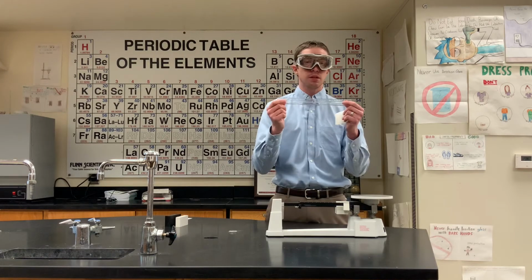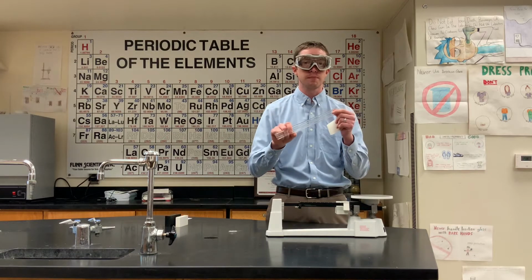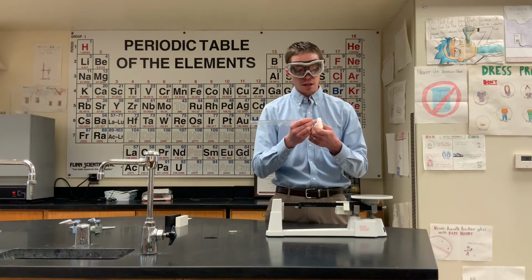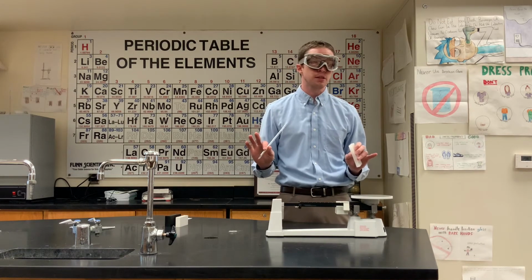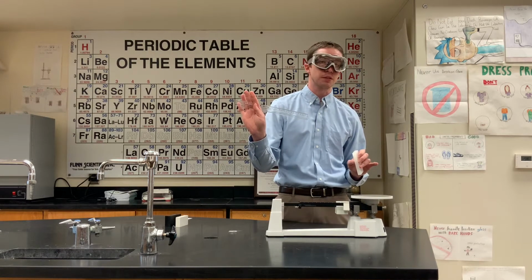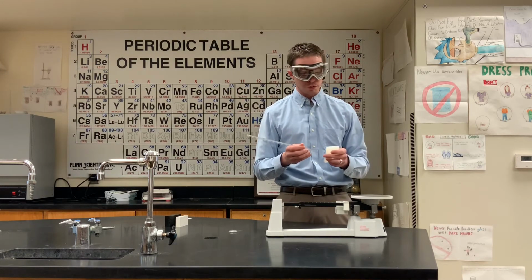So number 1, always make sure you're starting on the correct side of the ruler, which is the centimeters and millimeter side since we're in chemistry. And you're going to want to very carefully line up the 0 mark with one edge of the block. And I am going to call this, for the height, 1.24 centimeters. So we're also practicing good precision of measurement. The ruler shows you the 10th place, and you are allowed to go 1 place value past, which is going to be the 100ths of a centimeter. So 1.24 centimeters for the height.